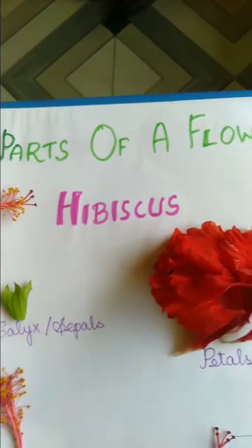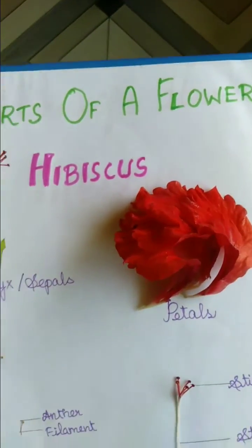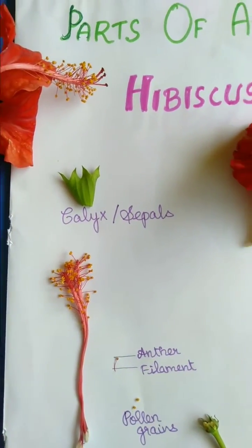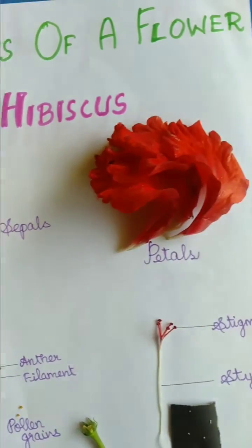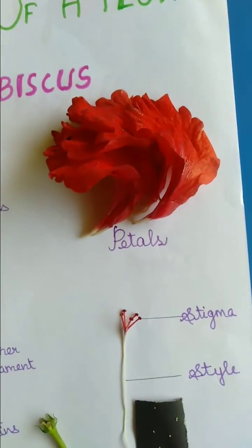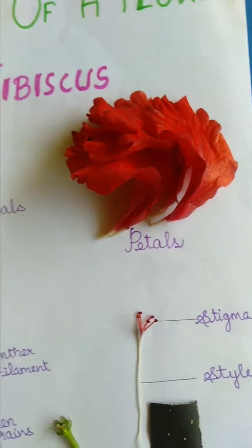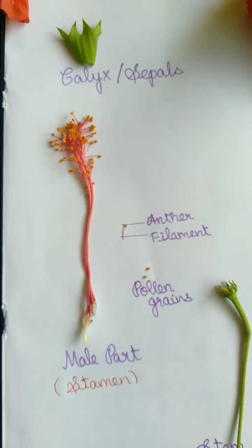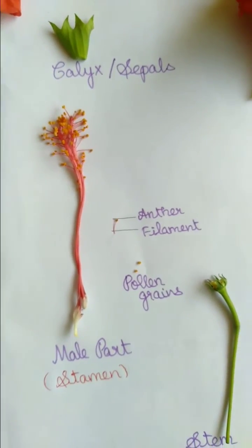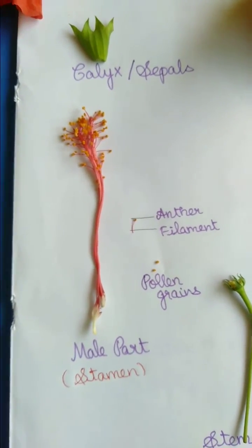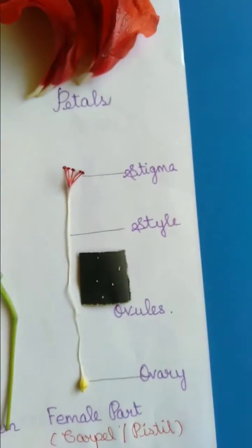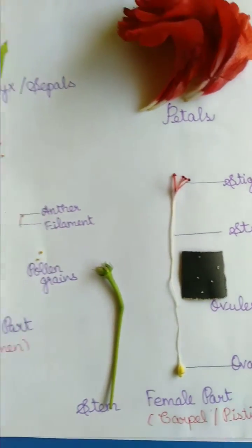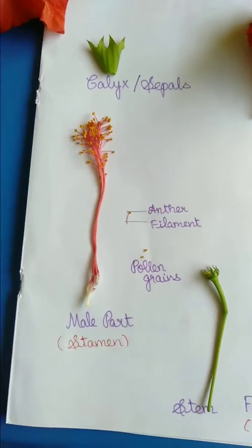Now see the parts of the flower. First one: calyx or sepals. Then the second one is petals. Then the male part, stamen. Then the female part, carpel or pistil.